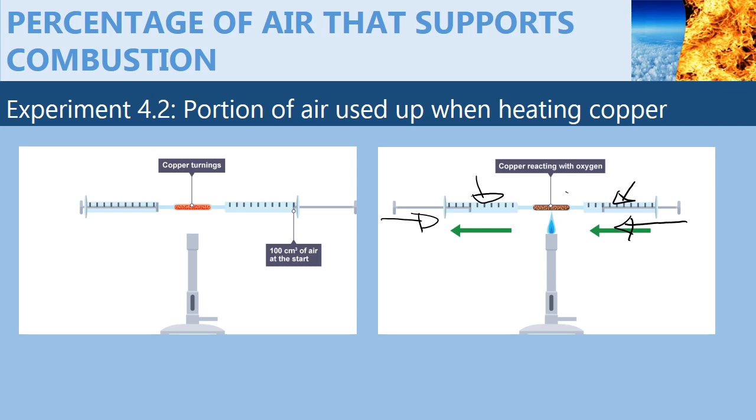The copper turnings will start to react with the oxygen in the air as it moves from one syringe to another.